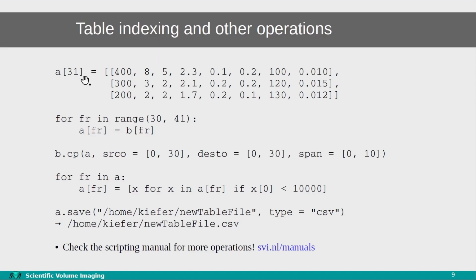If you use a linear index, it is assumed that you simply want to specify the frame, and you'll get all the localization information for frame 31, for example, and that'll be returned as a list of lists of values, where every list will be a list of properties for one localization, and if you have multiple of those, that just means that you have multiple localizations for this frame. This can be used to set, get, and filter localization information.